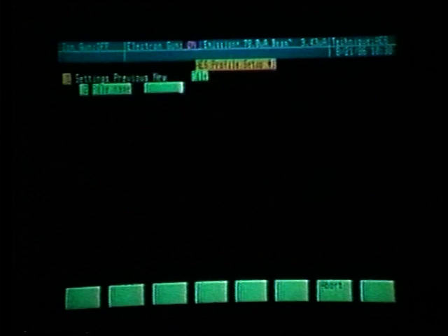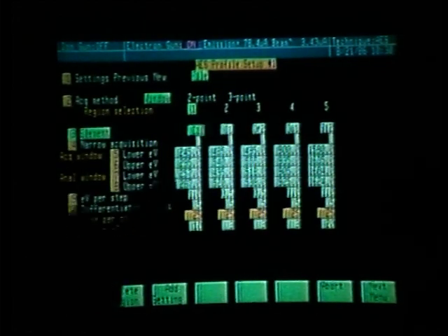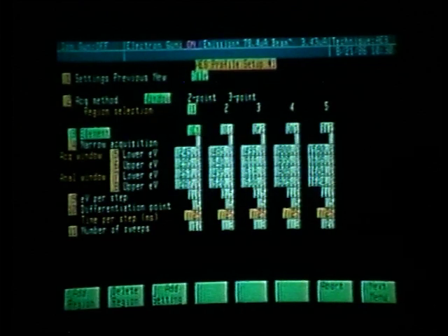This time we want to use the same parameters that we used, that being the window profile, file name PRO202. So let's press function key number 1 to file. We can then hit enter. It now asks for the file name, and we want file name PRO202. Automatically, we have the exact parameters that we used when we acquired the profile PRO202.